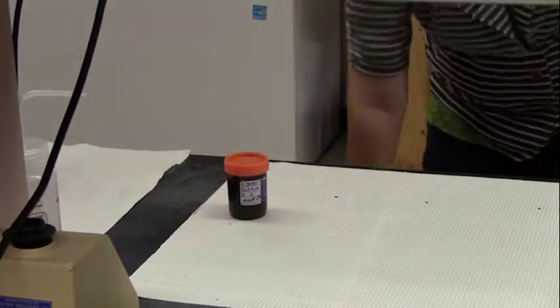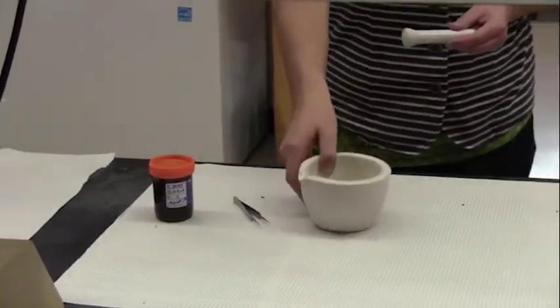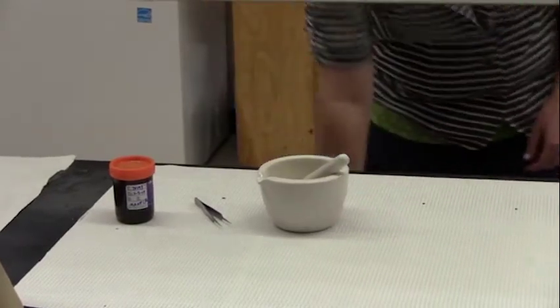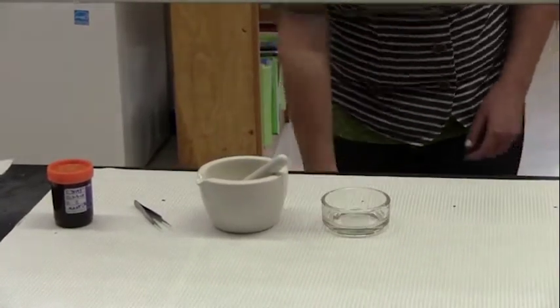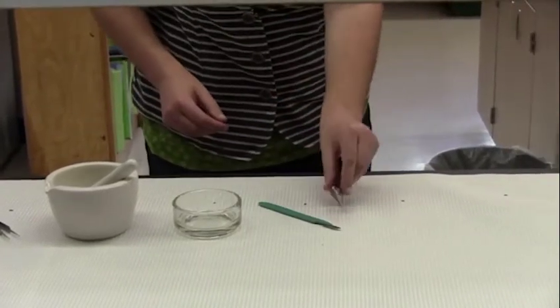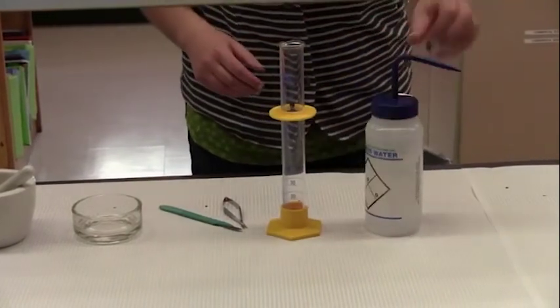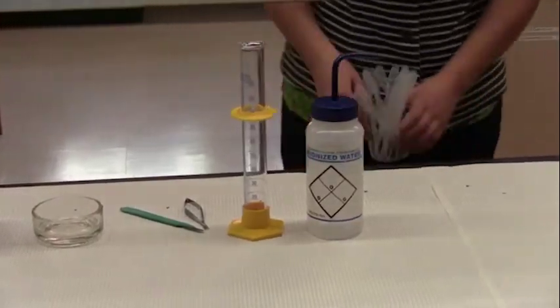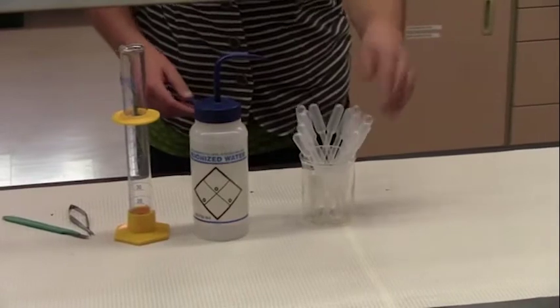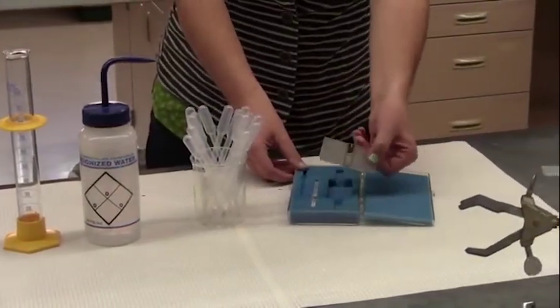The items you will need for analysis will be your stored sample, forceps, a mortar and pestle, a dish or container, a cutting utensil like a scalpel or micro scissors, a graduated cylinder measuring up to 100 milliliters and deionized water, disposable pipettes, and a hemacytometer with cover slip.